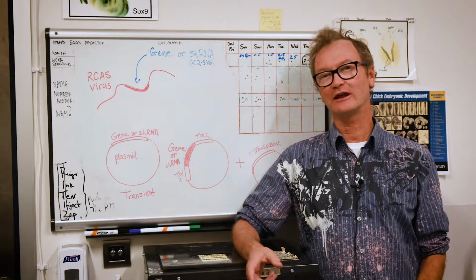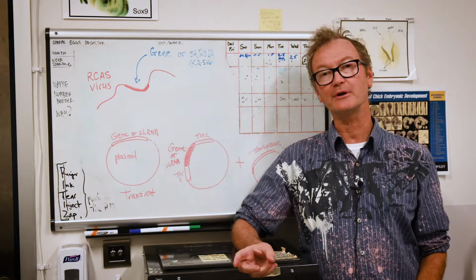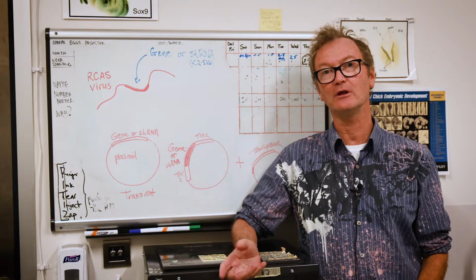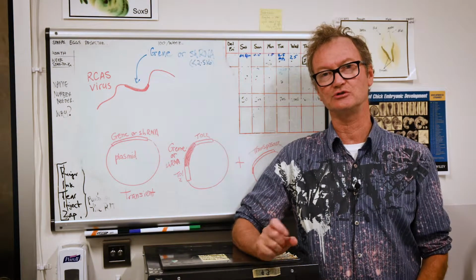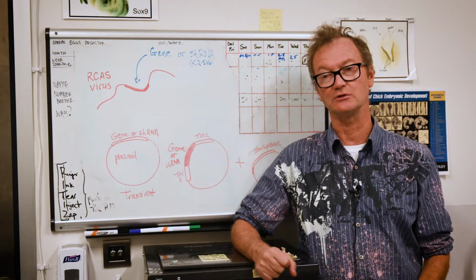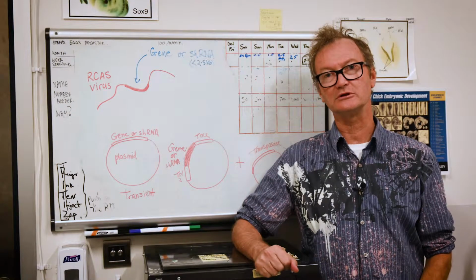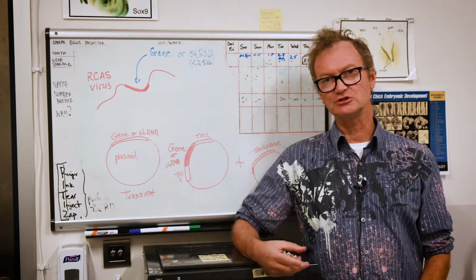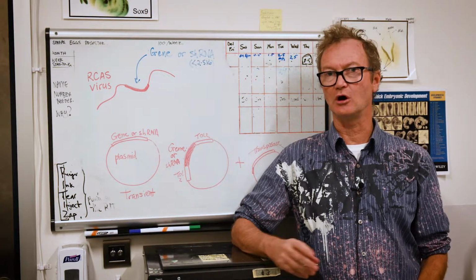In the case of electroporation, DNA is firstly injected into an embryo, into the area of interest, if you're interested in limb development, for example, and then an electric current is applied across the tissue that you've just injected the DNA into. DNA being negatively charged will move to the positive electrode. We use different vectors to deliver the DNA into the embryo, and they have pros and cons.